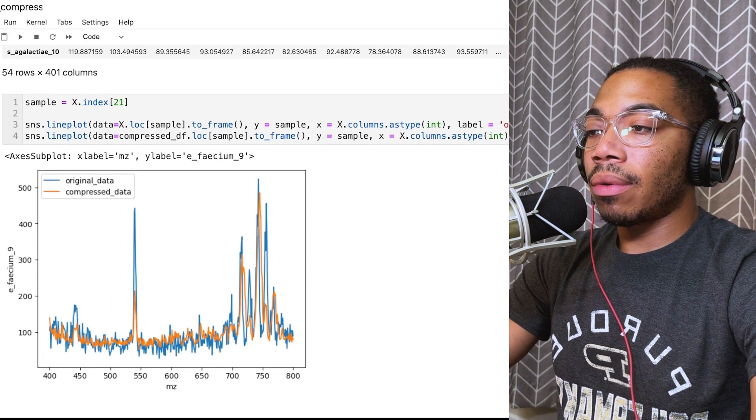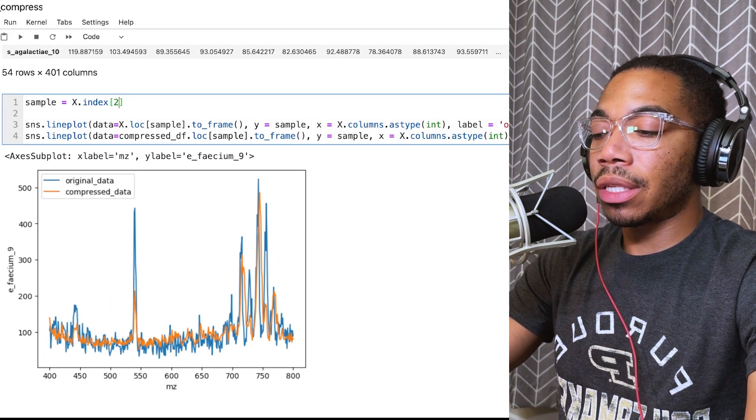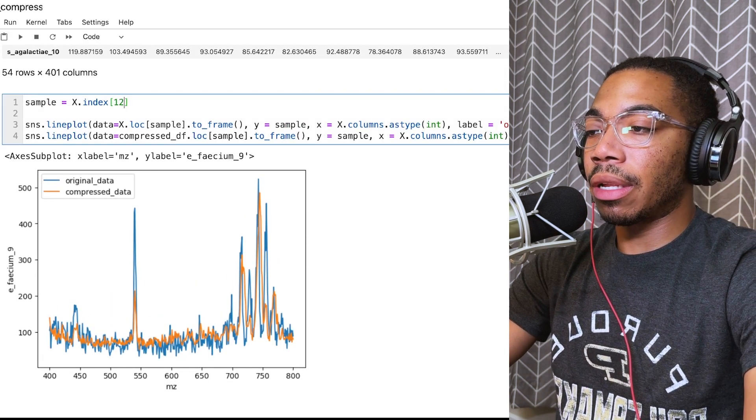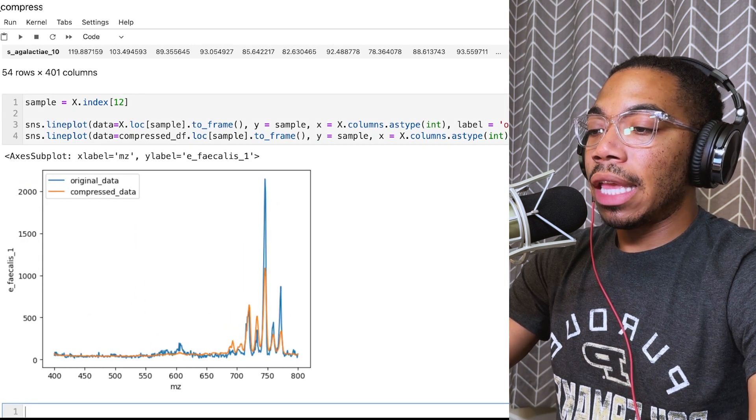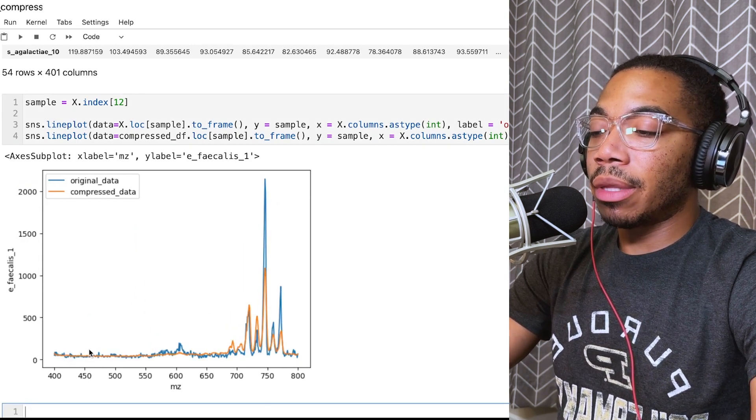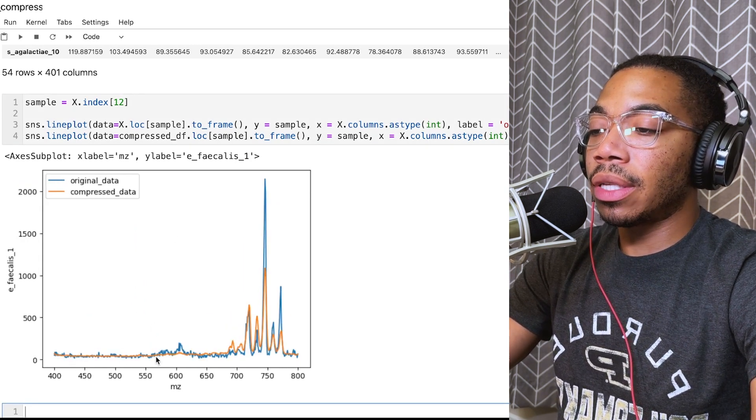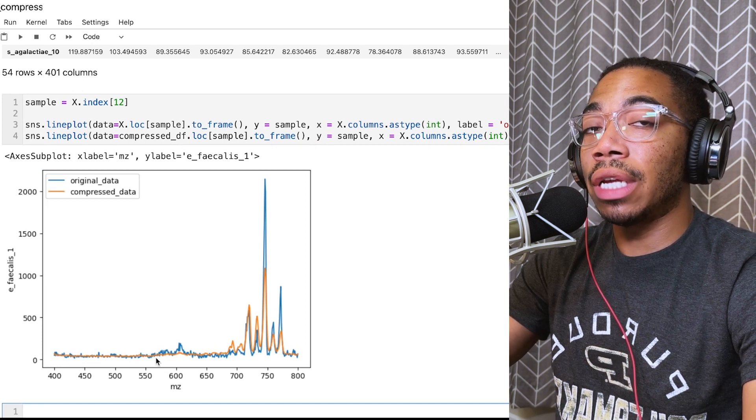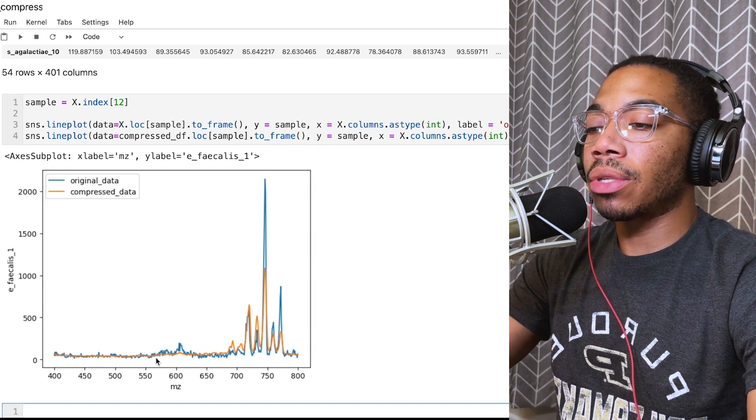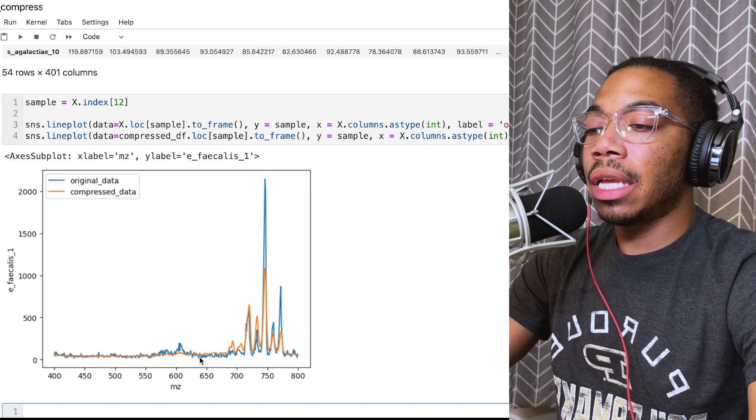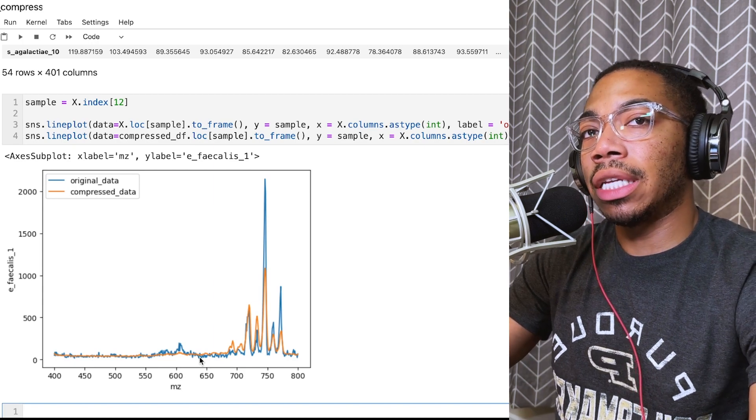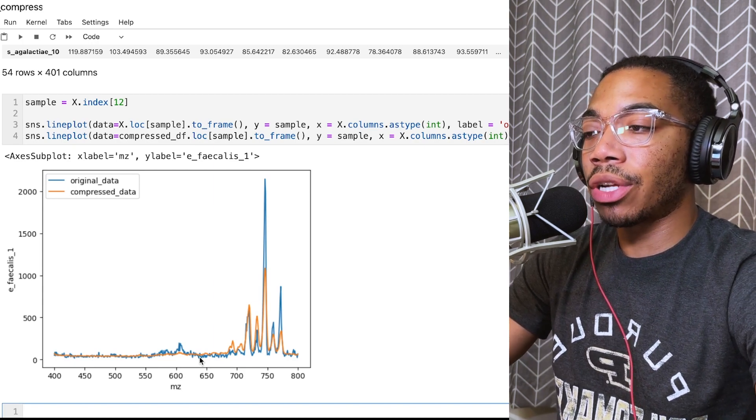Now let's look at another sample. Let's choose sample 12. You can see even with some of this high frequency noise, a lot of that is removed in this compression. Those are the smaller features that we actually give up when we do this compression.